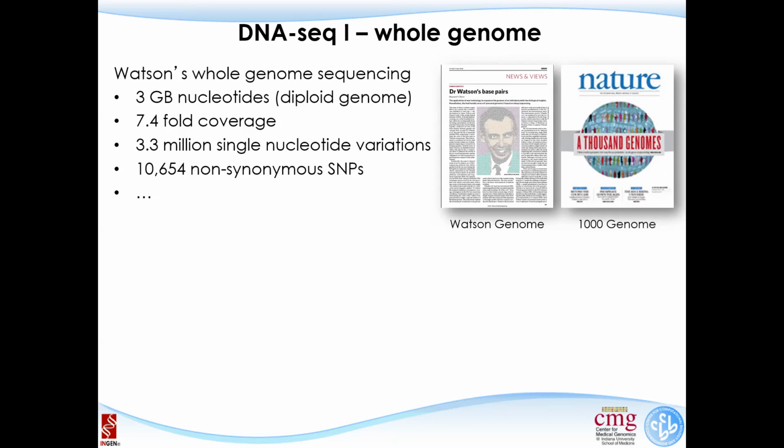So far our standard is that we will do about 30x coverage. So for every nucleotide, we will have at least 30 sequences covering that region so that we can make a confident call.